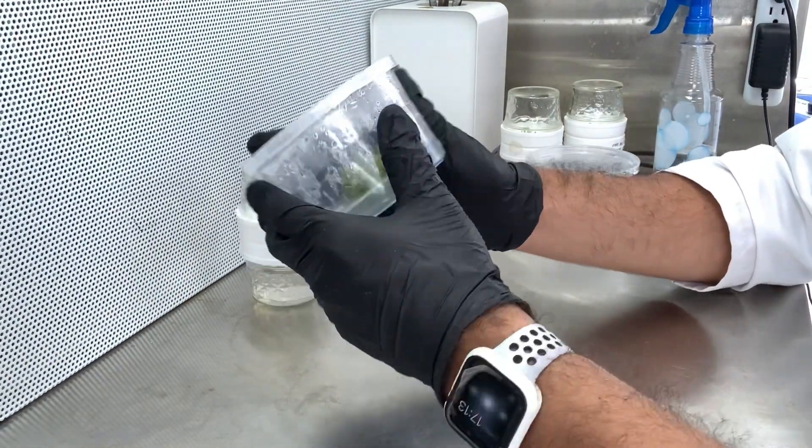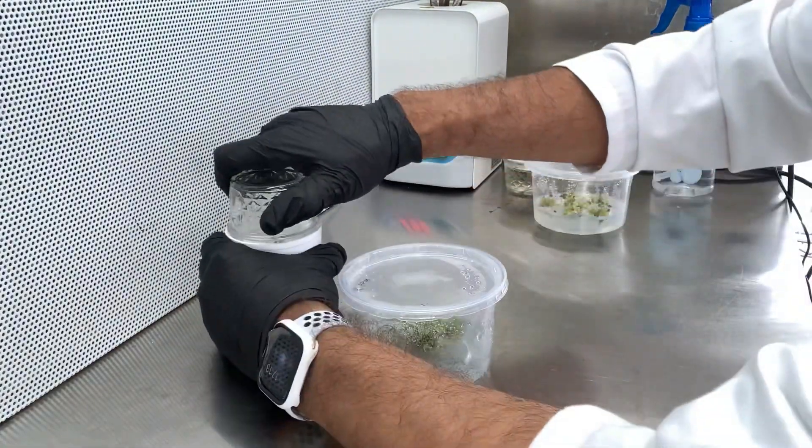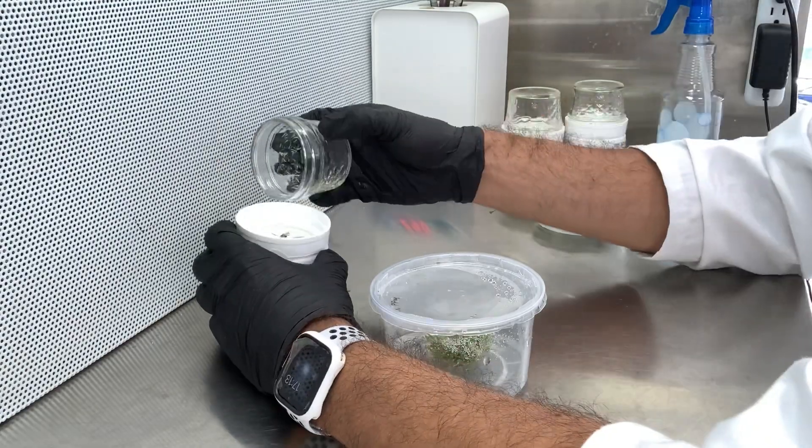On average, it takes less than a minute to do a complete immersion manually. At the same time, this is an excellent opportunity to inspect your cultures and check for contamination.